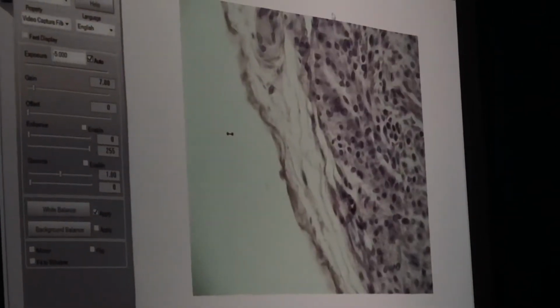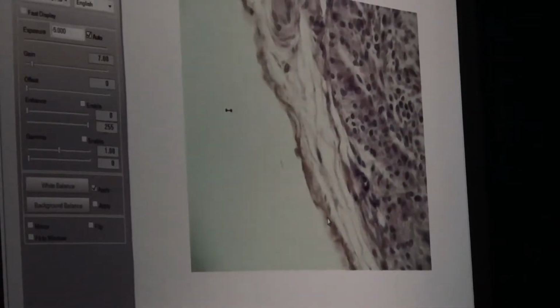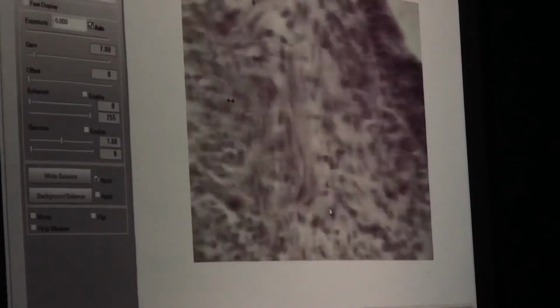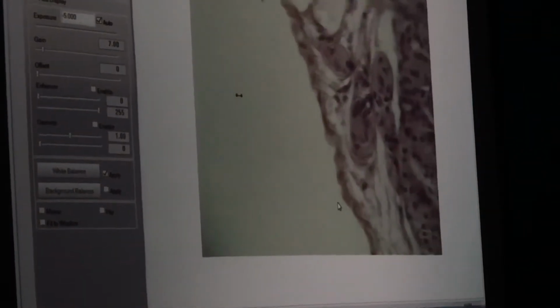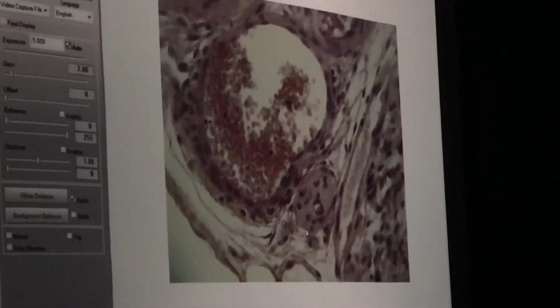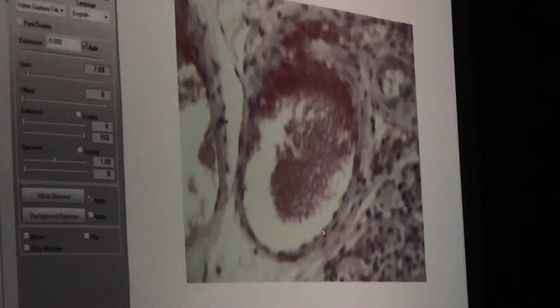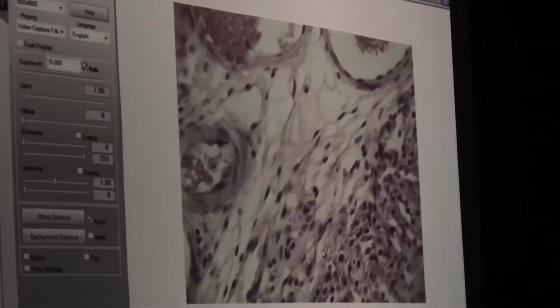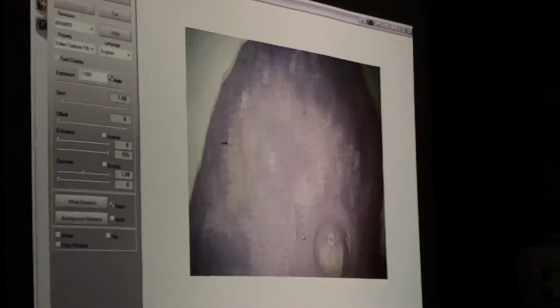And then if we get out far enough, what would this be? Adventitia? Yeah. Okay? So again, here's going to be our mucosa layer. We got some messy looking muscularis stuff there, and then our adventitia layer up there. Okay? Here's one of those blood vessels, maybe part of the spermatic cord. I don't see anything that looks like a nerve there. Oh, well. So, I'm going to start and look for different kinds of follicles.